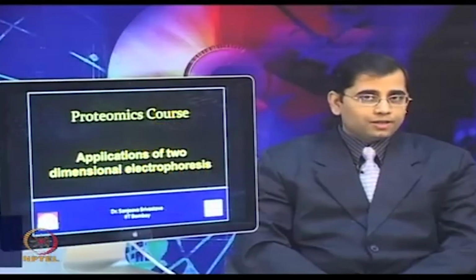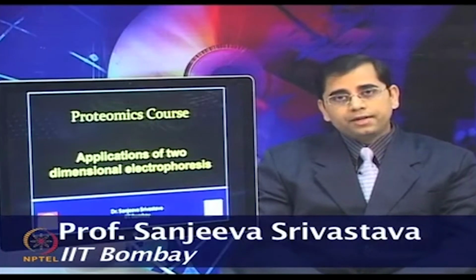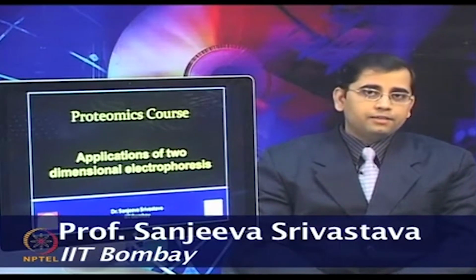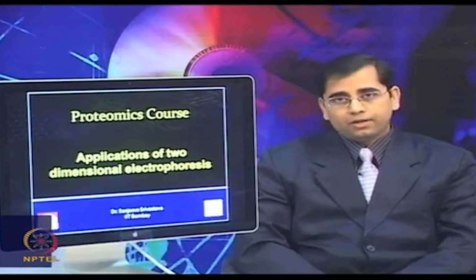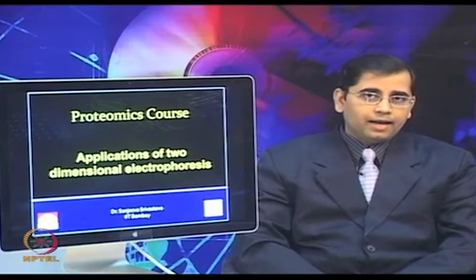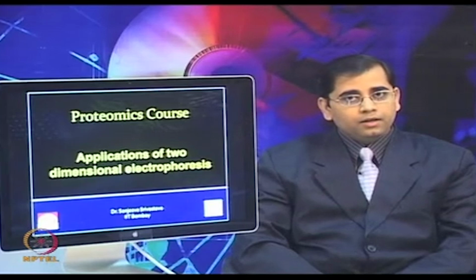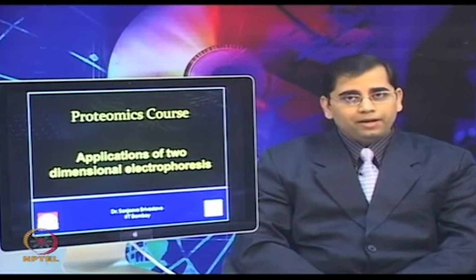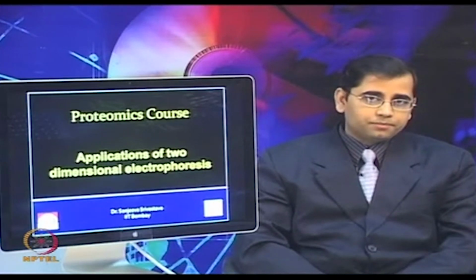In the last few lectures of this module, we discussed the two-dimensional electrophoresis technique. We discussed in much detail the workflow, how various steps are involved in performing two-dimensional electrophoresis, and difference in gel electrophoresis. Now, today we will talk about how these techniques can be applied for understanding some of the biological questions.